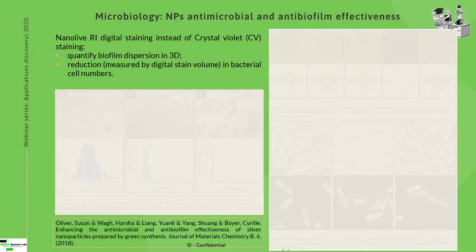So instantly you can have the number of them, and even better, the volume of them in 3 dimensions. So you can make an estimation of how much percentage of your population the nanoparticles are killing. So that is the first application that your holotomography can guarantee you.